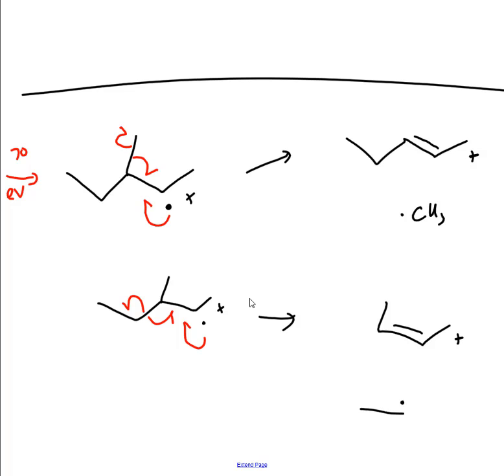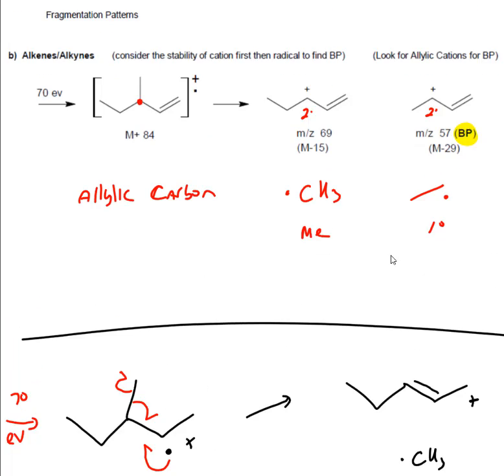Still positive there. So do you notice that when you do this, and I didn't mean to make it cis, I just kind of left it, but trans, cis, doesn't matter, but obviously trans is more stable. So notice that I got these two. You see that? These are those right here.